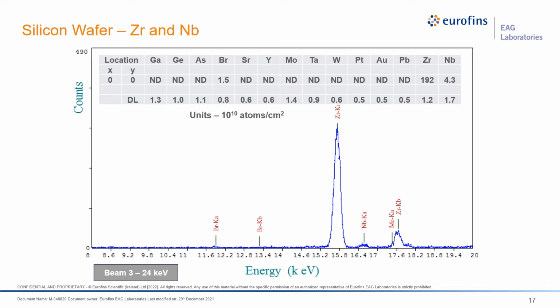So what I've wanted to show you over the past few slides is generally what our spectrum looks like. We provide these to clients as well as the tables at the top here as well. But I want to highlight one of the strengths of TXRF now, which is the mapping capability.